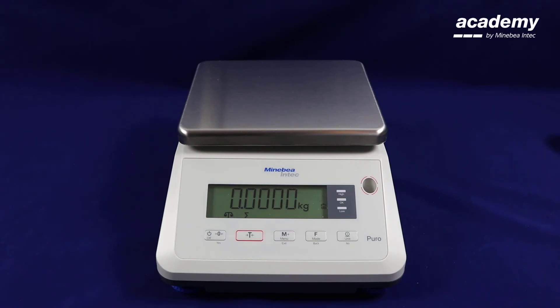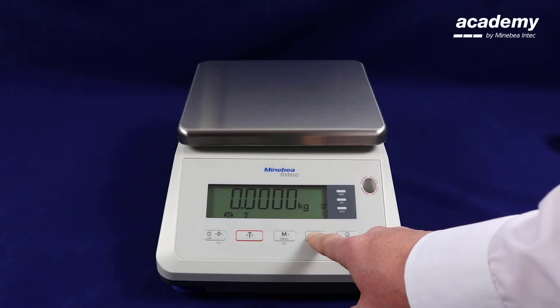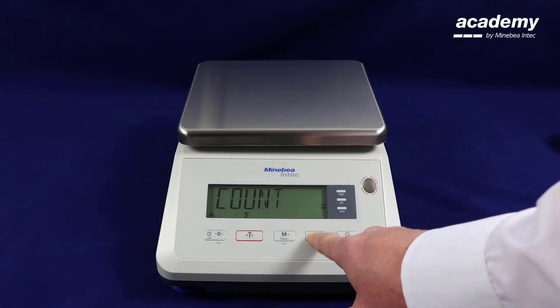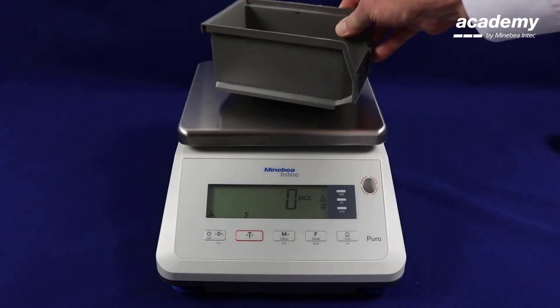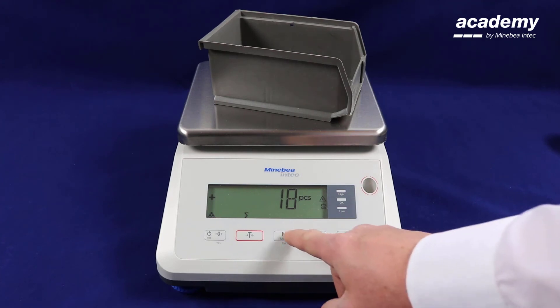We will now demonstrate how to use the counting application along with the totalizing application. To activate the count, press and hold the function key until counting appears on the screen; release the key to accept. Using the no key, we will keep the existing reference value for the counting application. Place the first sample and press M plus — we are storing the piece values in the totalizing memory.